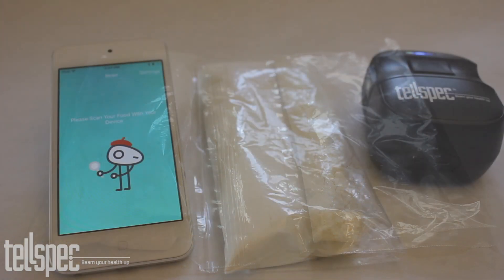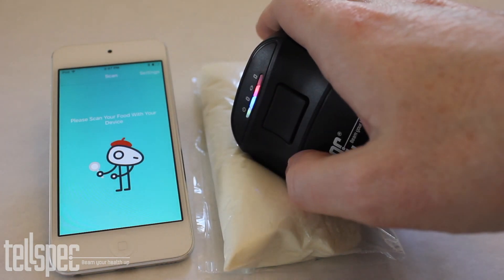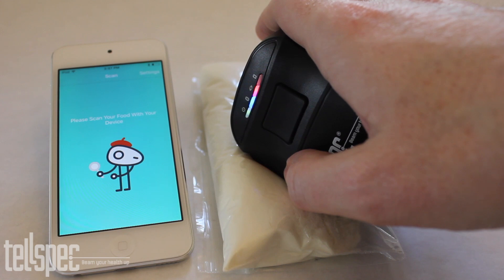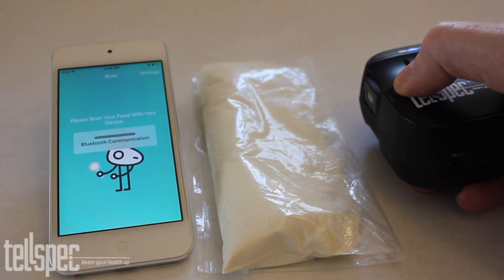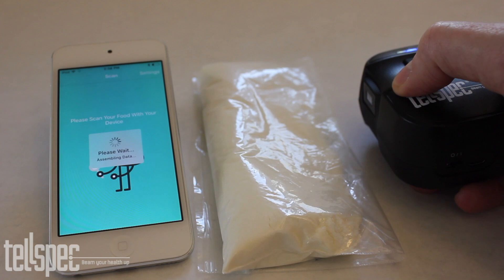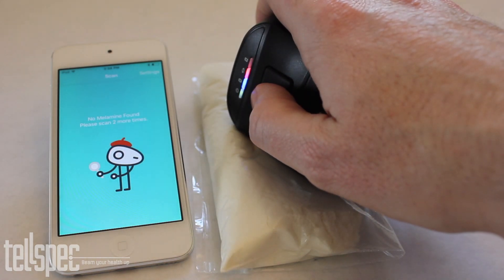Let's scan them. First we take a scan of the baby formula. The information is sent to the phone, from the phone to the cloud where it is analysed, and from the cloud the result comes back to the phone that no melamine was found and to do two more scans.